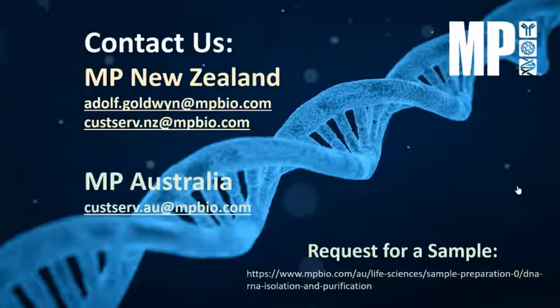In fact, for one of the troubleshooting steps, we also make sure that the washing step is carried out twice. We want to ensure that the ethanol is added into the bottle, because these are some of the common mistakes that sometimes people make when they are doing their DNA extraction. So a couple of troubleshooting tips there that you can pick up and try, to see whether it improves your 260/280 ratio.